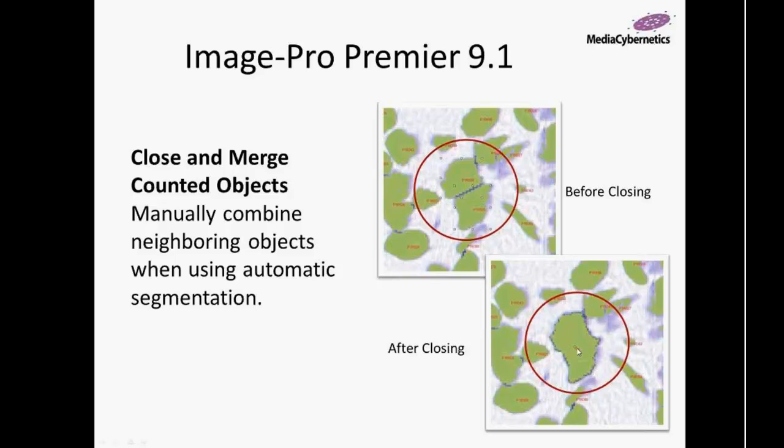Again, there's the reverse, where we can do some object splitting. Instead of having to do a manual split, we can do it automatically, and there are parameters to make this more automated. Here, this will work only on whatever objects you select, again coming from the Measure ribbon.